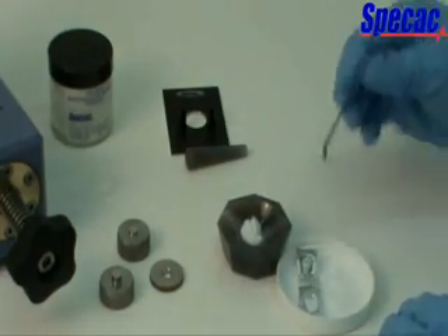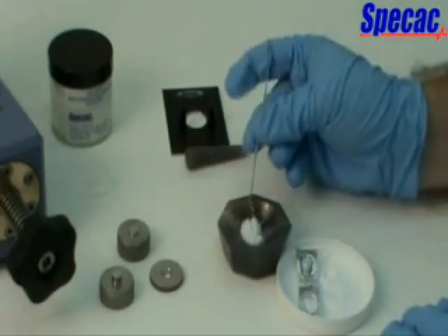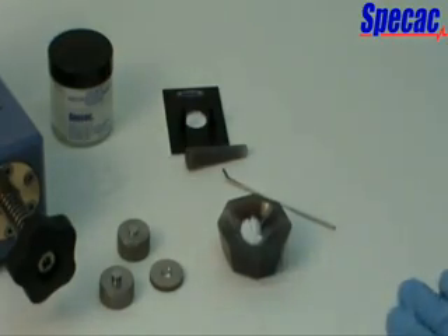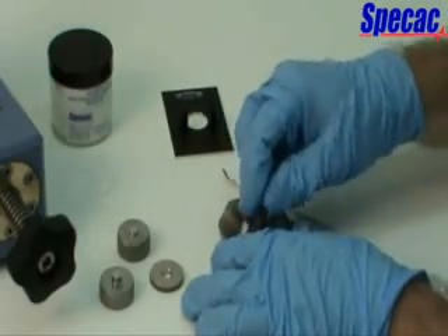In our example, a paracetamol tablet has been pre-crushed to mix in with the KBR powder. The KBR powder and sample is ground together until a consistent mixture is obtained.